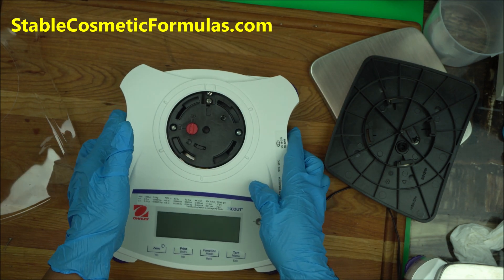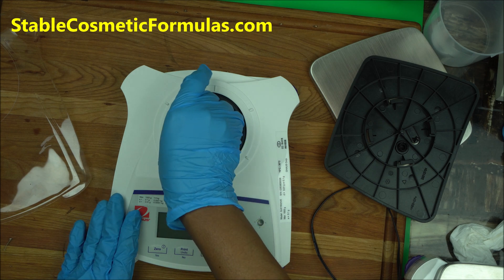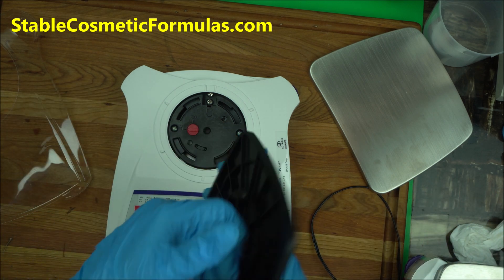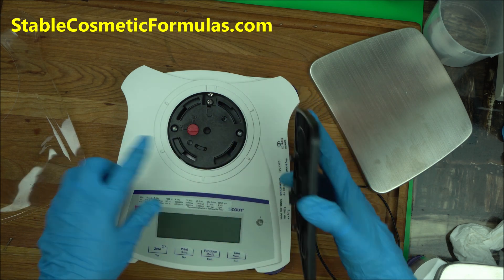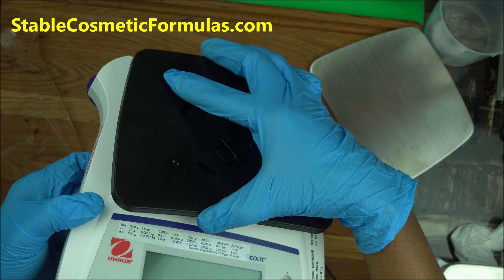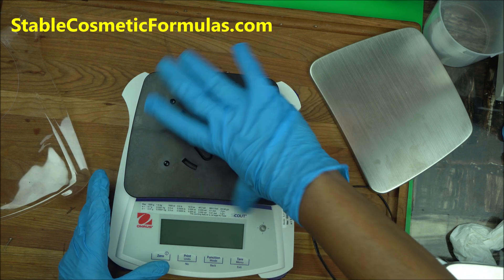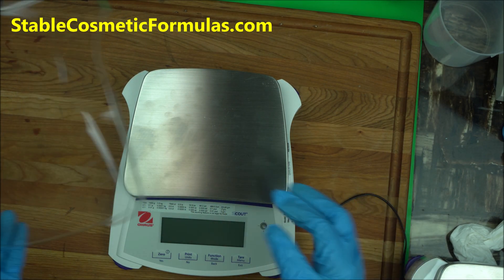Unlock it and place it on a plain surface. This is a shipping lock — it's a safety feature to protect the scale from damage. Turn it to the unlock position; that's your first step. If you have this exact model, the SJX 1502, this is the area you set up. Put the support rod into that hole — I find it easier when I lift it up — and turn it to lock it down.